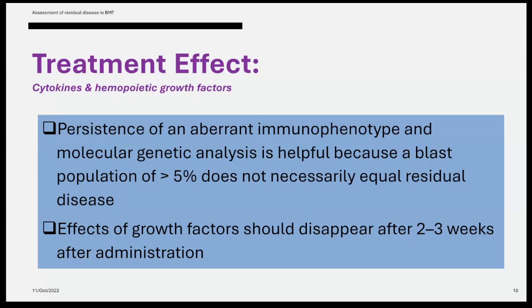Please correlate this blast finding with the molecular genetic or IPT, as some of these treatment-related blasts can also be seen, and that's not necessarily equal to residual disease.